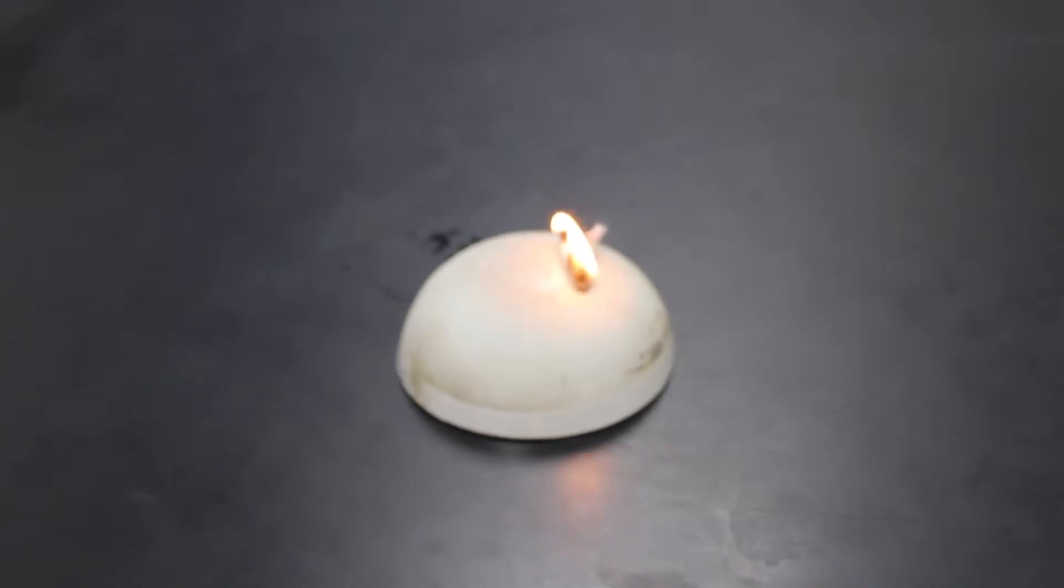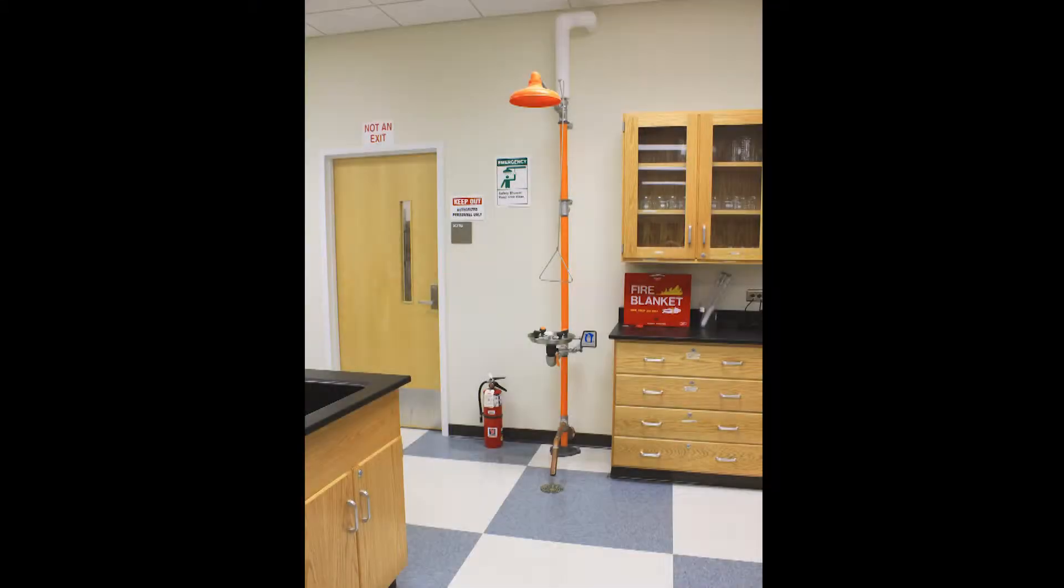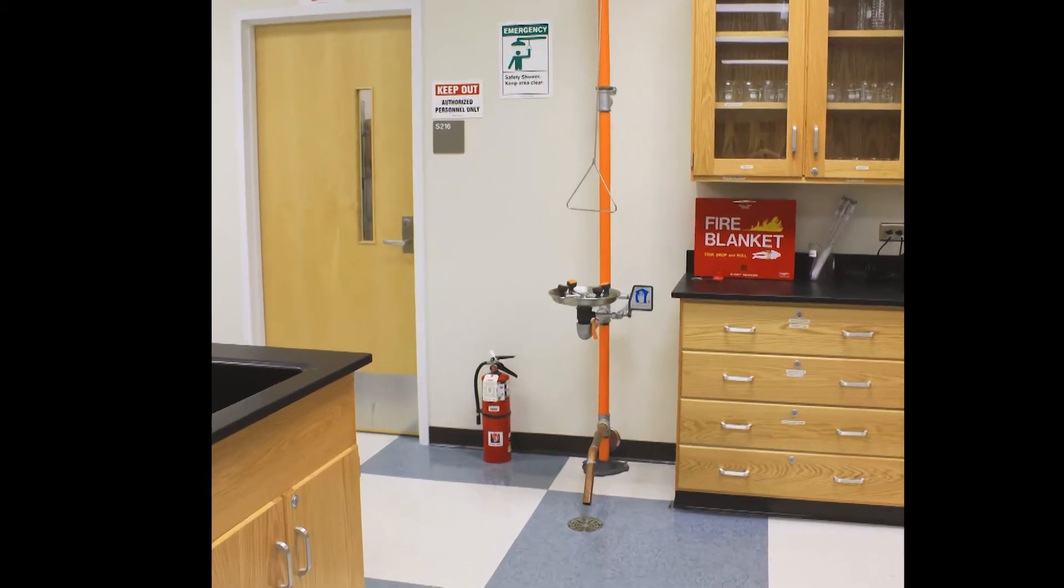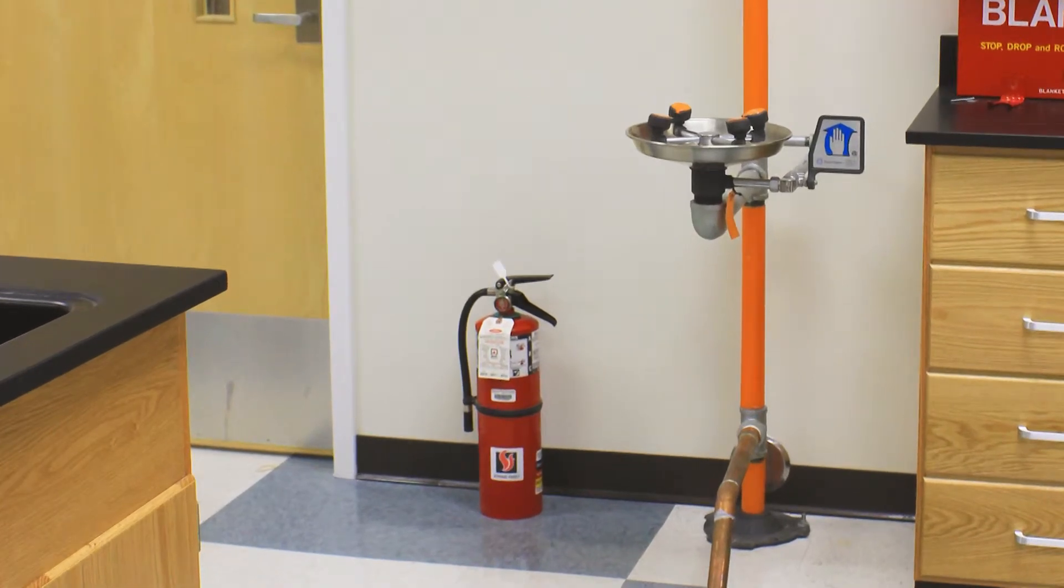Notice the location of the fire extinguisher. The fire extinguishers in the chemistry labs at PCC are ABC type extinguishers and are appropriate for use on most common combustible liquids or electrical type fires.